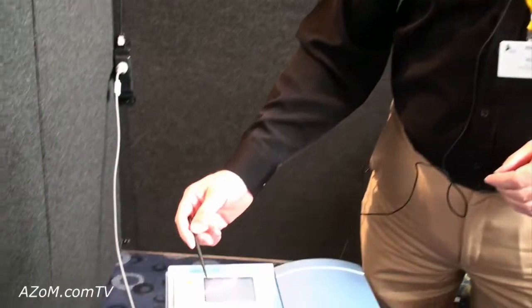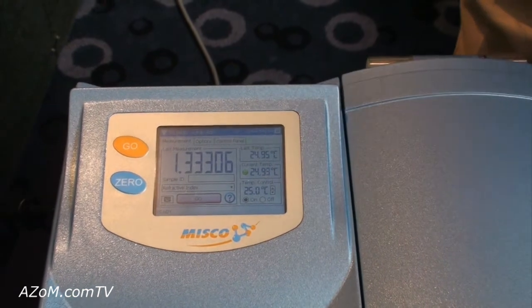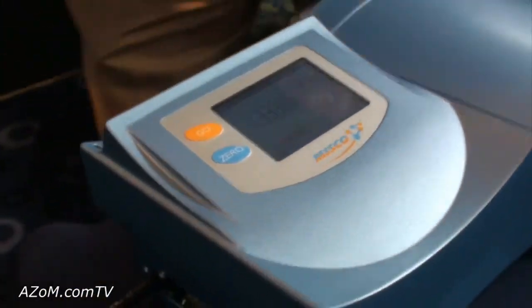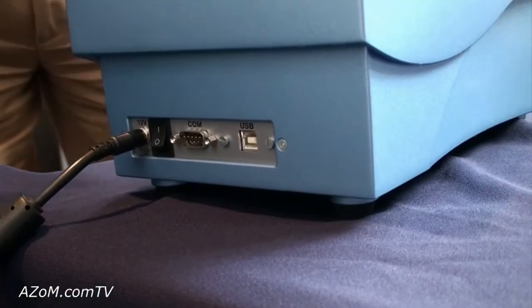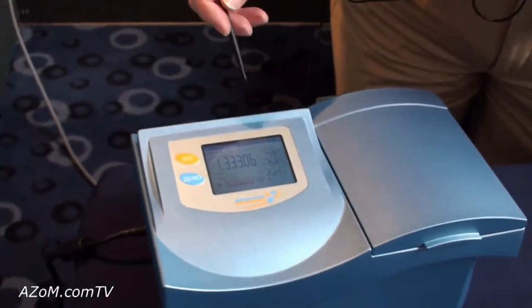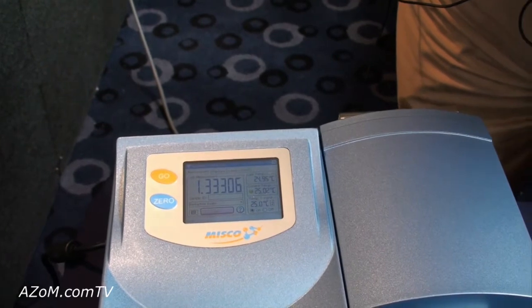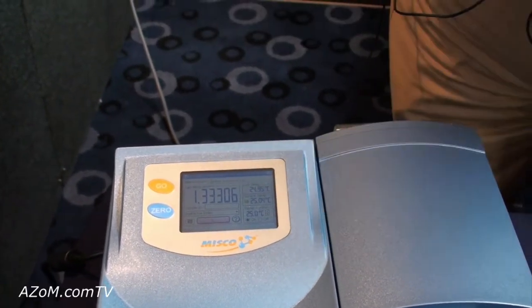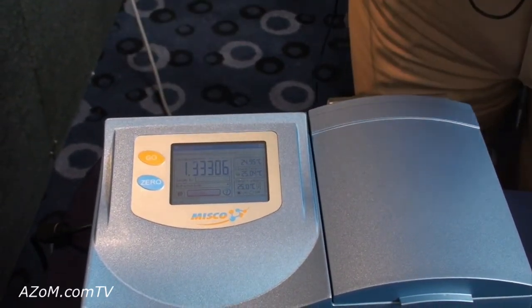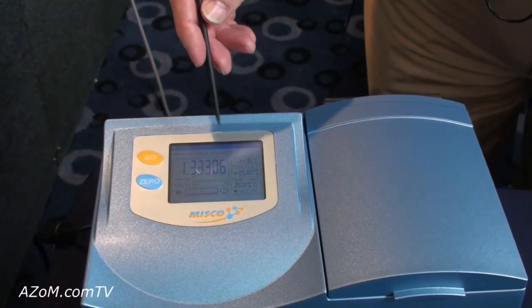It has a screen here which is running Windows CE, so it's a Windows-based instrument with current technology and all of the communications ports around the outside to give us interactivity with other computers. The instrument is a five decimal place, high resolution, high accuracy Benchtop Refractometer. At the moment we have a sample of water in here which is not truly pure, so we're slightly away from the ideal refractive index for water at 1.33306.